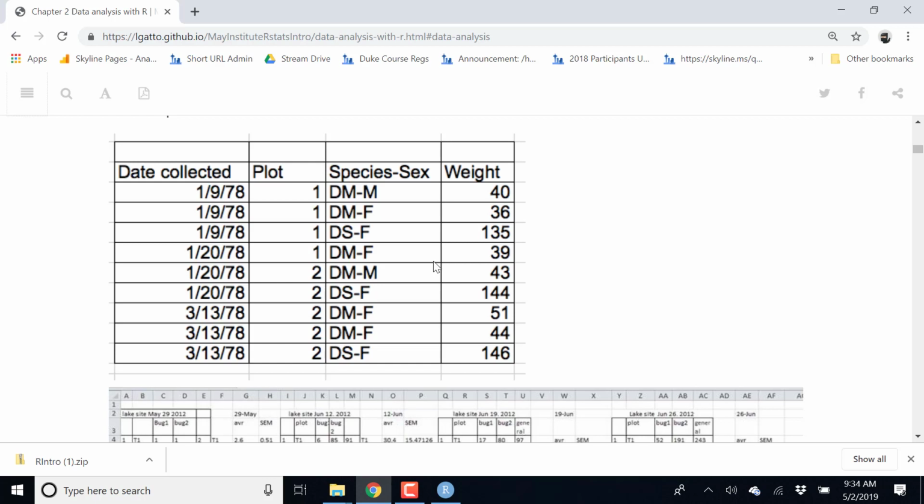Yes? Would it be critical if we change variables and observations? The variables would be in the lines, because for example, if we have proteins and replicates, then the observations would be proteins, right? Or replicates. Is it free or is it something else? So for the type of data analysis that we're going to go into later in the afternoon, typically you have your observations along the rows and your variables along the columns. Now, your observations could be different proteins, and then the variable that you have is an intensity, but then you could have intensities in different samples. I'm going to come back to how to encode it.